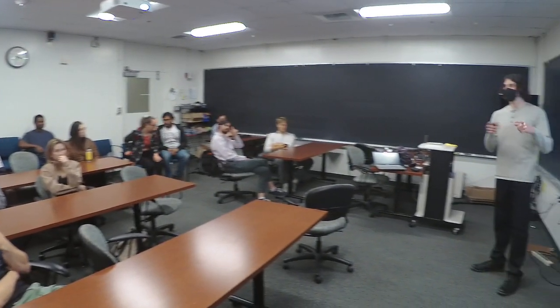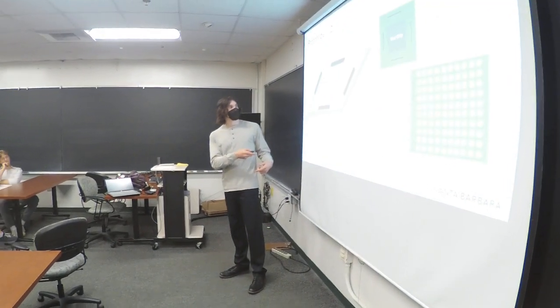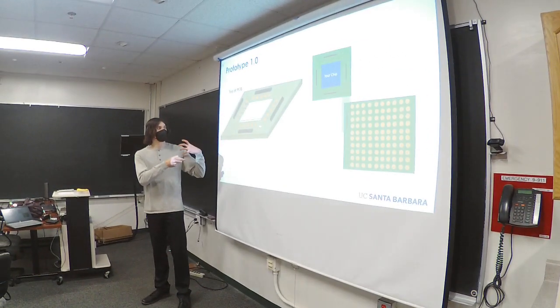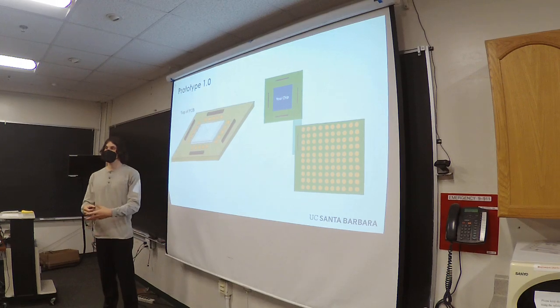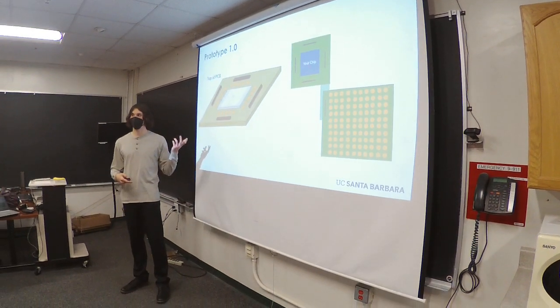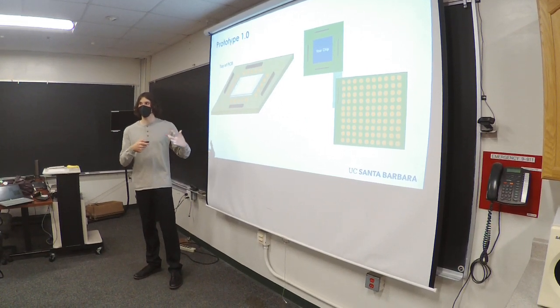But how would you integrate that part that you can buy? Is that the same technology that you use now, or is integrating it also very complicated? Integrating it is not too complicated. You just hook up all of the electrodes. So instead of having the bond pads correspond to a bond pad on the wafer, you would have this electrical component that would connect directly to these pads. It would read in all the signals, and all you really have to do is provide it the proper power so that the chip has enough electricity to be able to function.